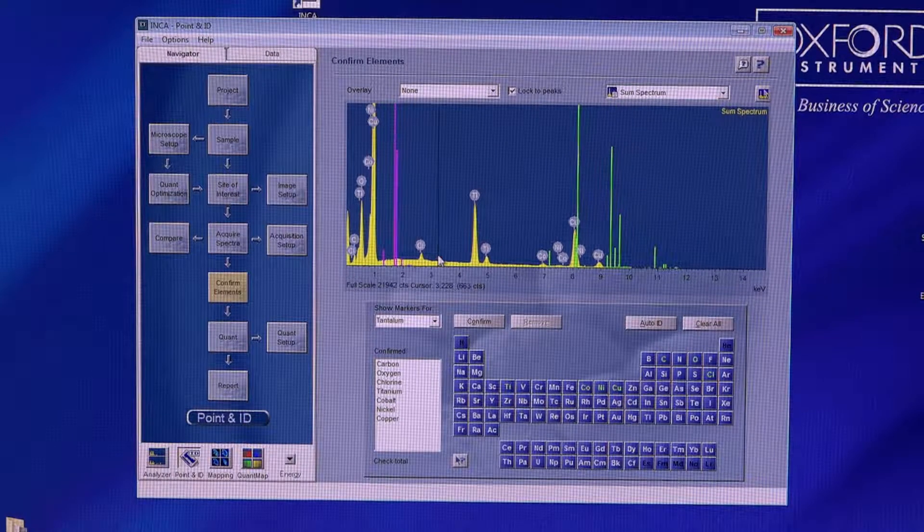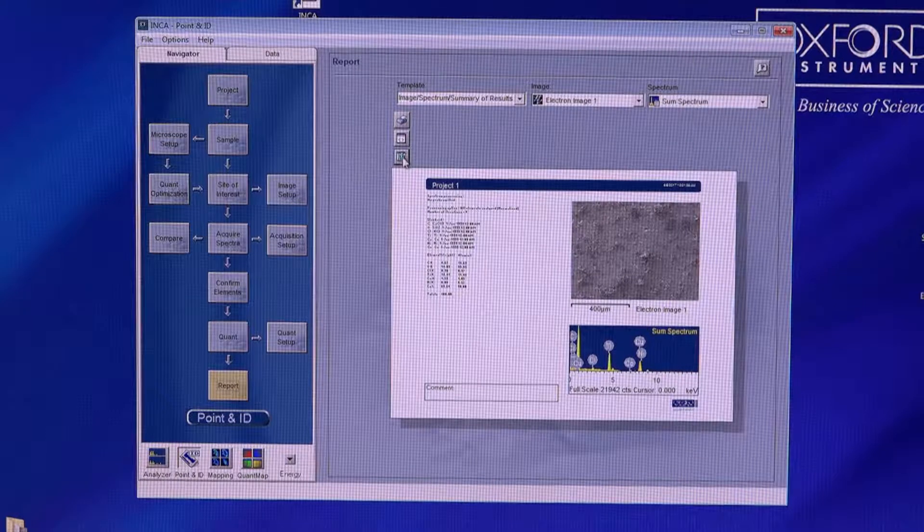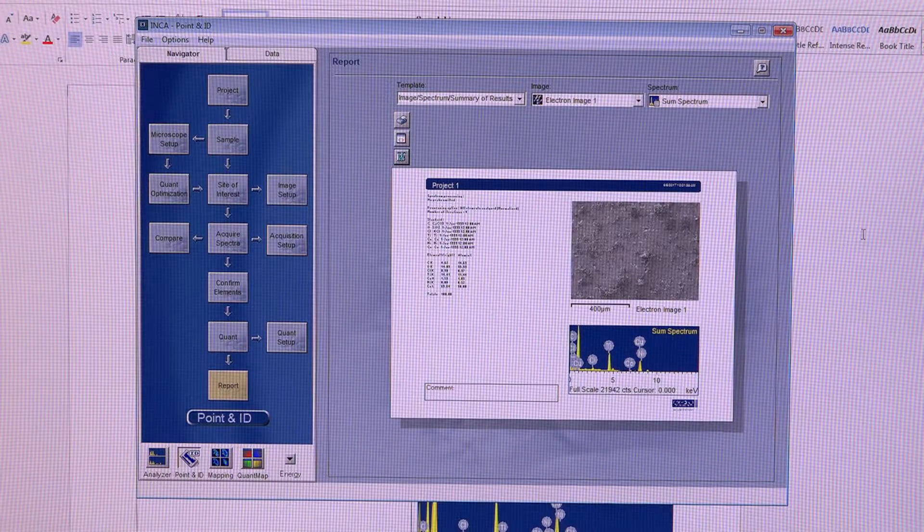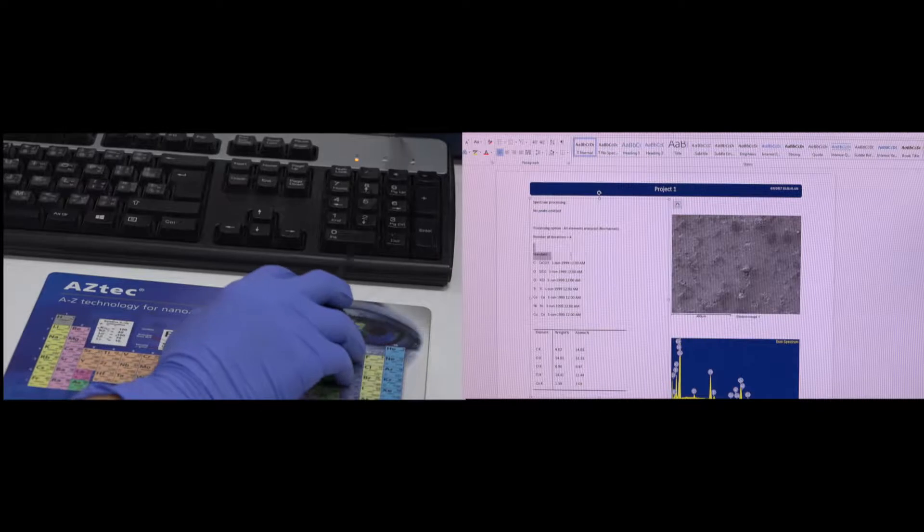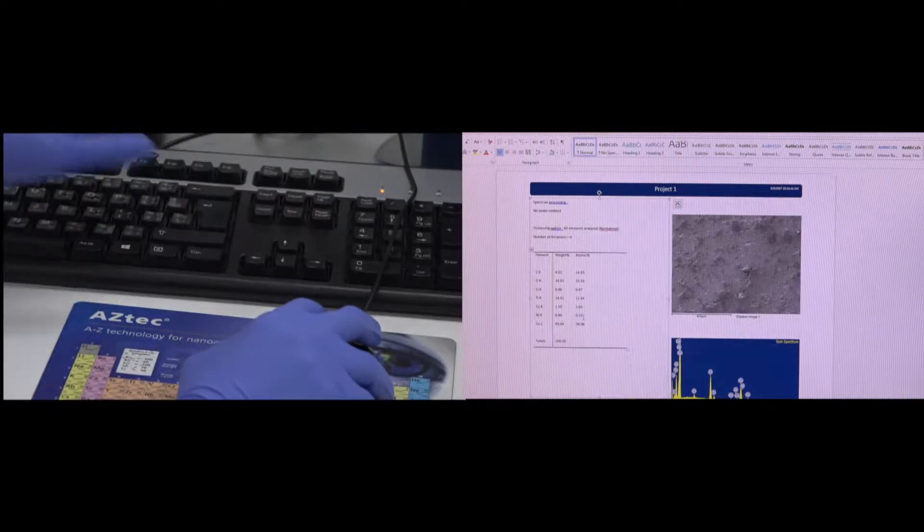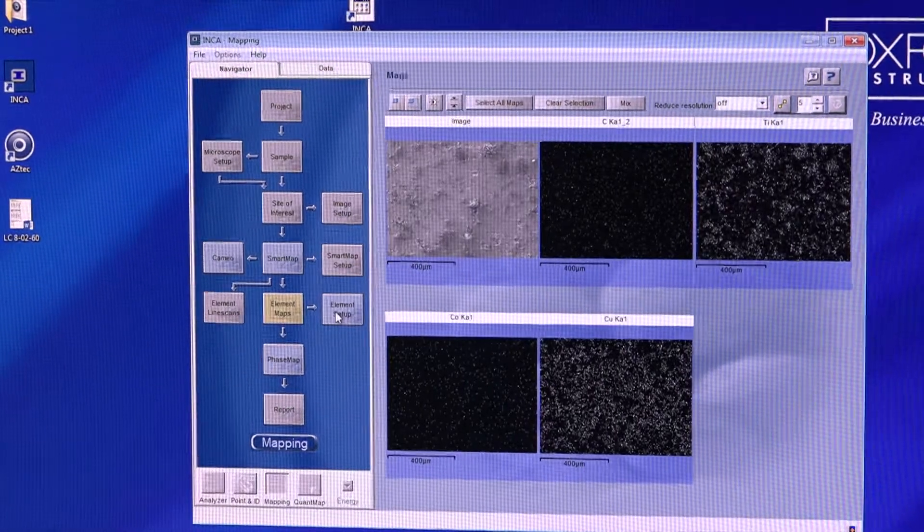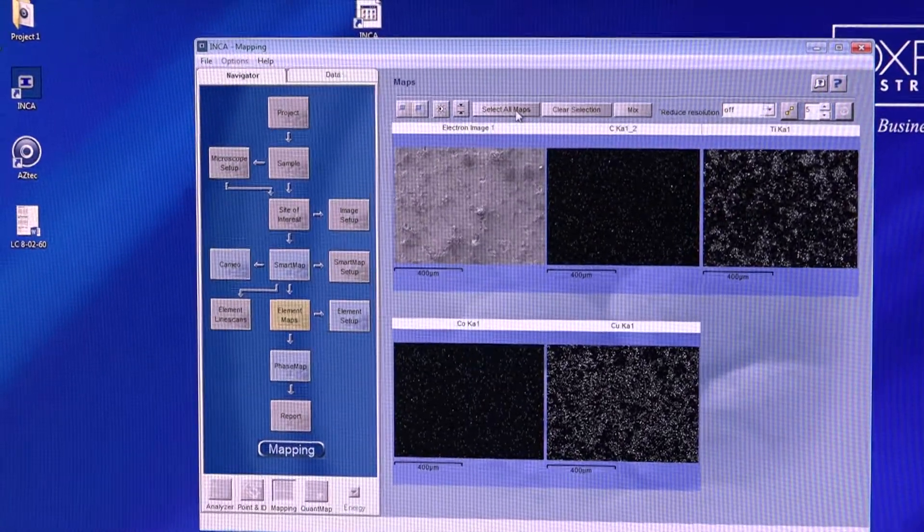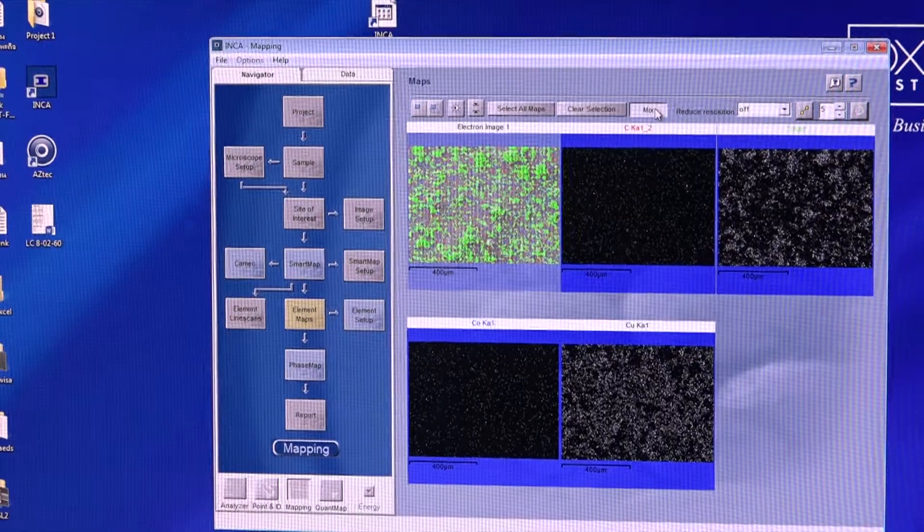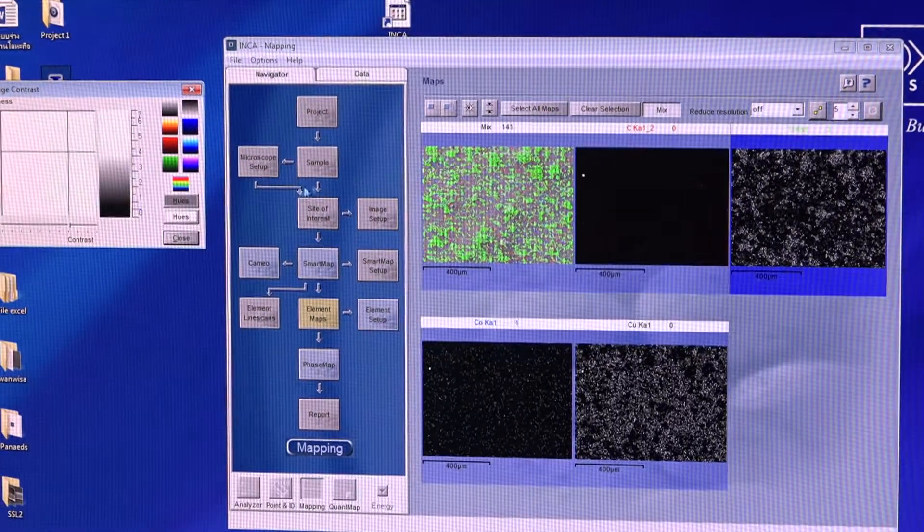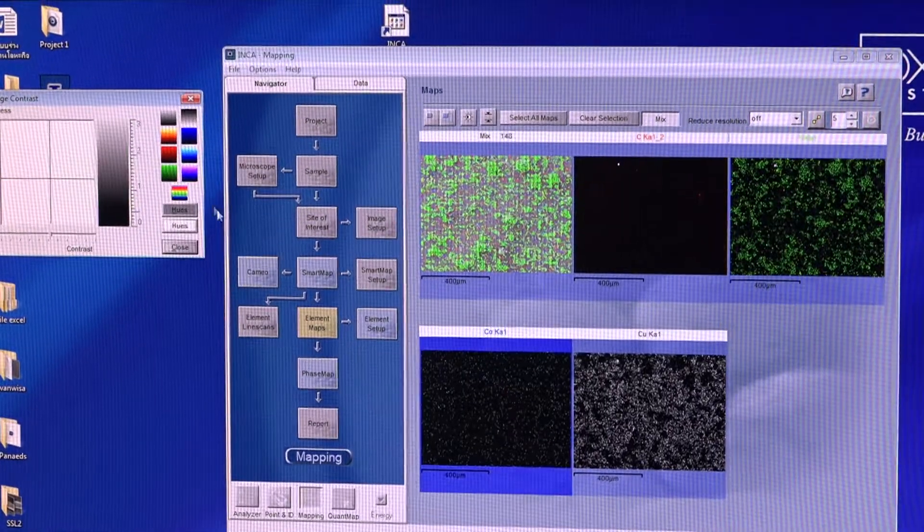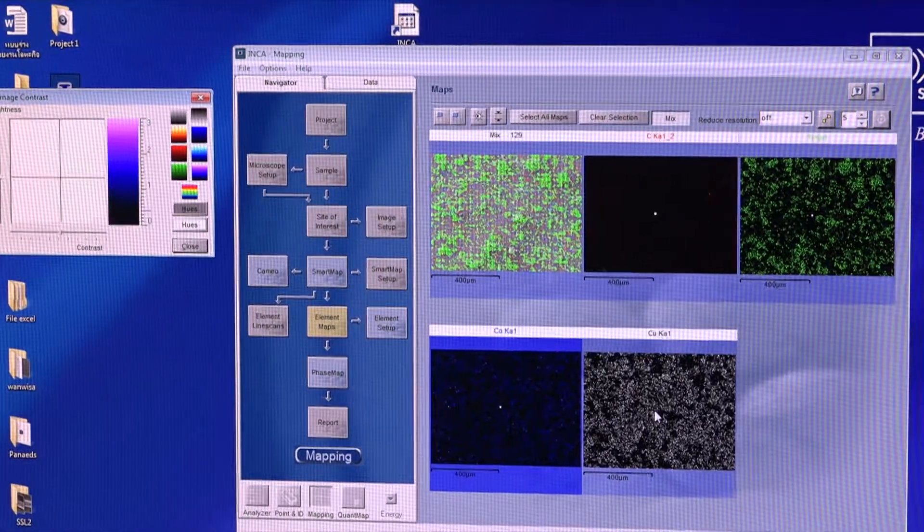Specifications of this model include tungsten filament source, 3.0 nm resolution at HV mode and 4.0 nm resolution at LV mode, 5× to 300,000× magnification, SE and BE detectors. Additional EDS is equipped for qualitative and quantitative mapping and line-scan elemental analysis.